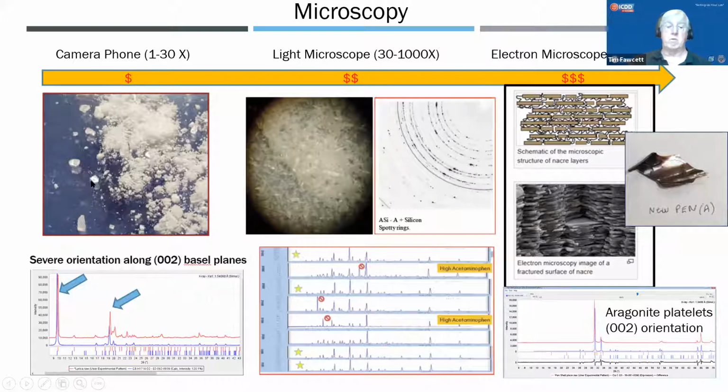Here's a picture. We know automatically, just looking at the picture, that we have 2 materials. One is a large particle, so that correlates to orientation in the XRD. The XRD can provide the specific orientation. It's telling you that the other phase in here, the alpha lactose monohydrate, is what this fine white powder is.